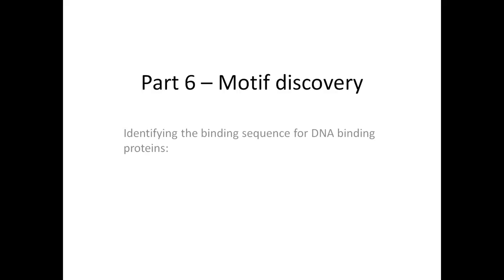Welcome to part 6 of a series of videos describing how to perform ChIP-seq analysis using Galaxy. In this part I'm going to add some more flesh to the bones of the MACS2 peak caller results.